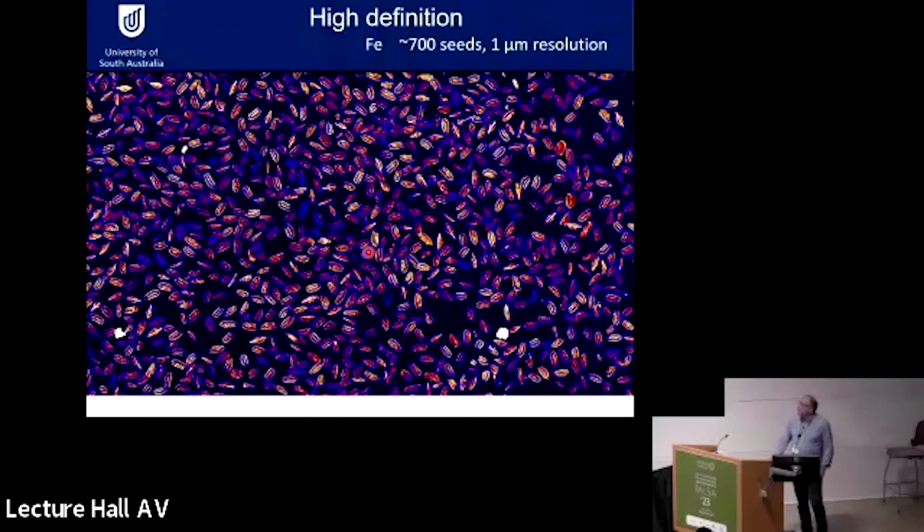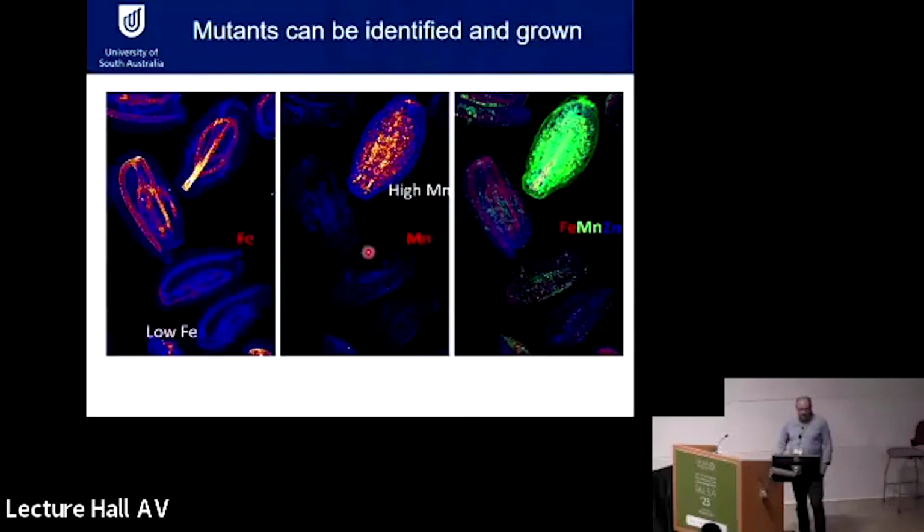And of course, I had to put this one up for Mary Lou. This is what you do with Arabidopsis. You can scan a little bit finer, but again, this one takes just a few hours, and you get a decent amount of information, and you can at least look at different mutants and probably get concentrations from small seeds. I think the quantification would be easier to do then as a pre-screening.